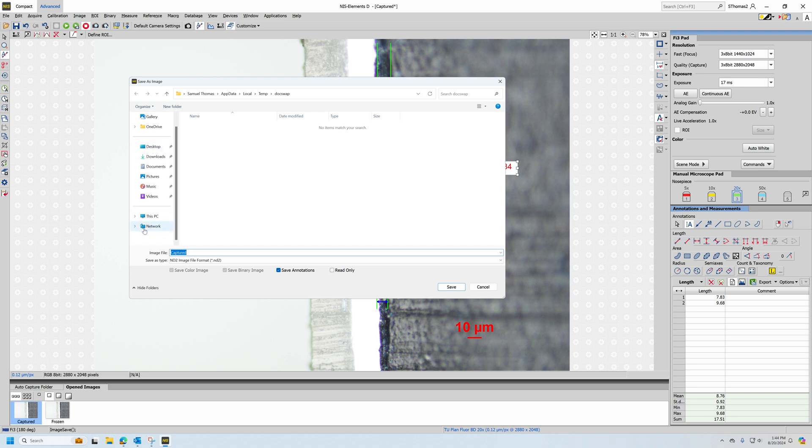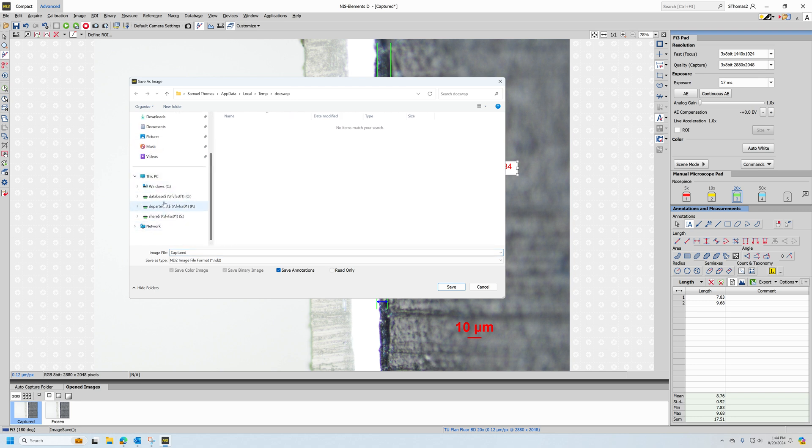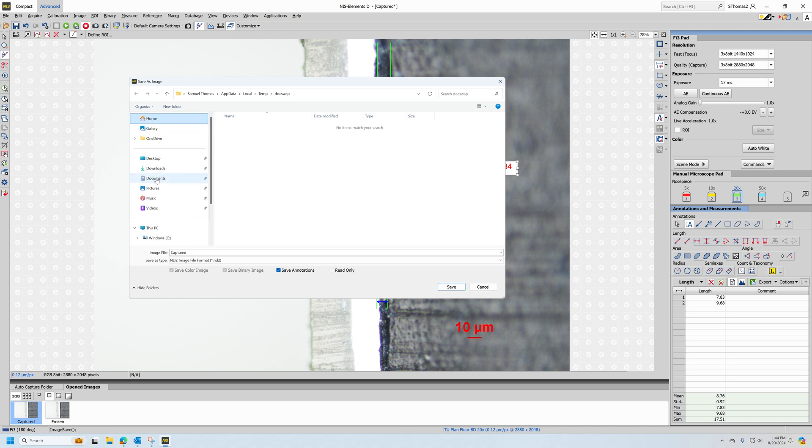I can save to any of the mapped drives that are on the server, or I can save locally to the desktop or to documents or pictures. For example, if I say desktop, I want to save to the local desktop, I want to give a name, I can say sample image.